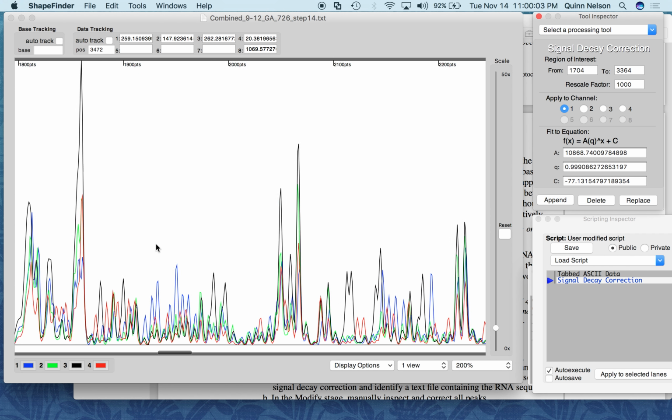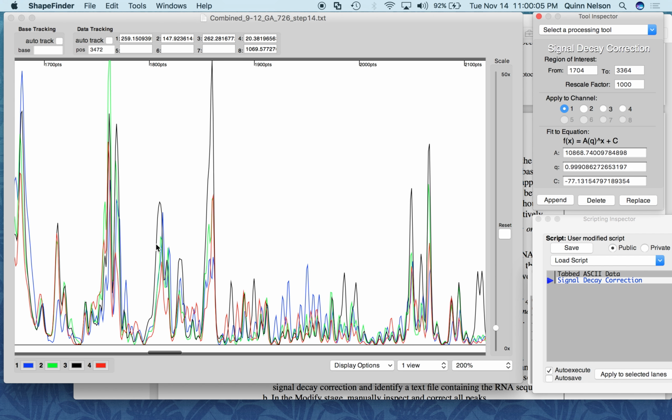Holy smokes, something happened to channel 1. Well, it got corrected, okay? These values changed. That's all right. Now we're going to select apply to channel 2. For A, we're going to enter 1,000,000 again. 1 and then 6 zeros. 1, 2, 3, 4, 5, 6.